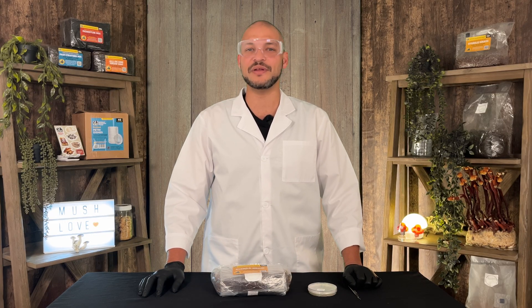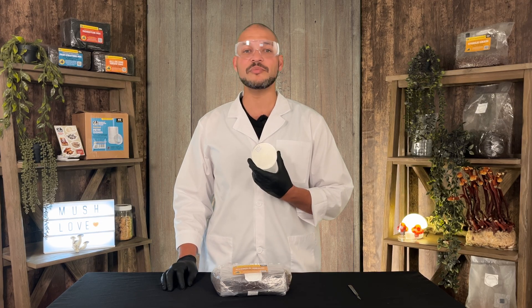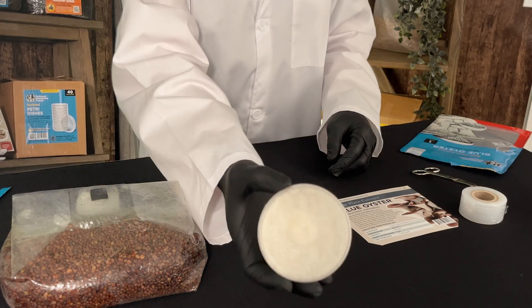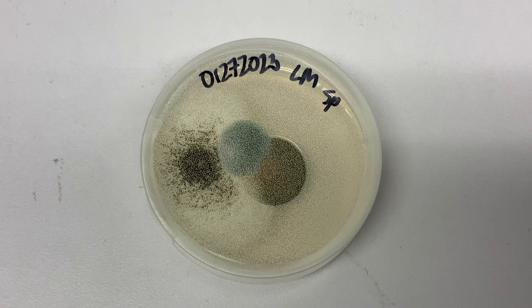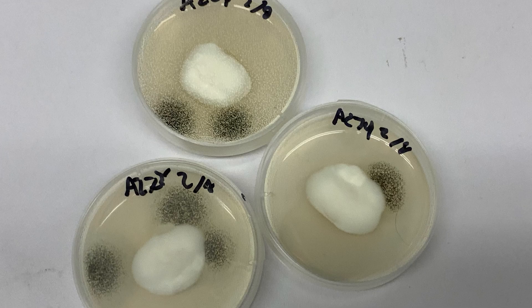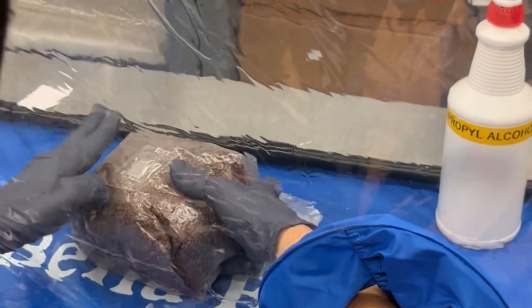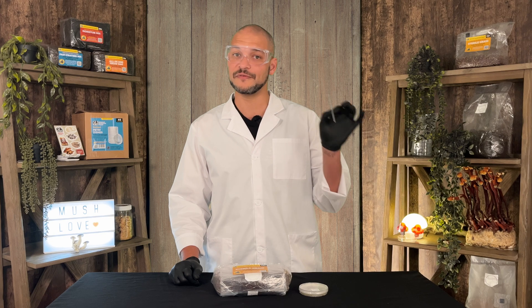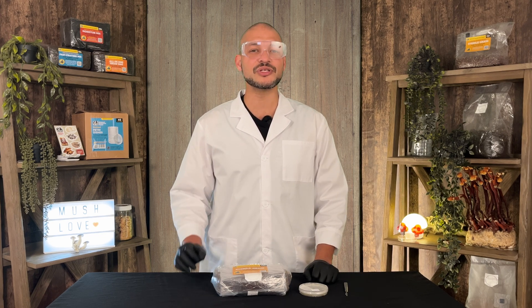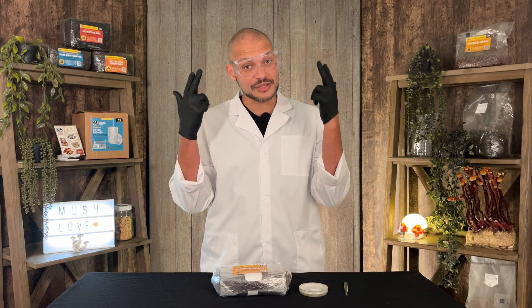Another tried and true inoculation method is agar cultures, which can result in stronger colonization and makes contamination much easier to spot. The trade-off is it requires a bit more equipment and care. Agar plate cultures are a solid medium where mushroom mycelium has already started growing, allowing you to work with isolated mycelium and ensure you're using a clean, healthy culture. Contamination is obvious — it would be visible as a rainbow of colors, most commonly green, black, or fuzzy wispy growth. When working with agar, use a still air box or laminar flow hood, wear gloves, and wipe everything down with 70% ISO. Use a sterile scalpel — a red-hot scalpel ensures no bacteria or mold interferes. If using a still air box, keep open flame outside as vapors can ignite.